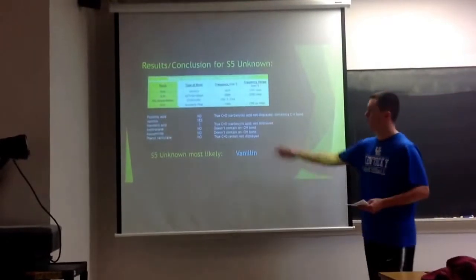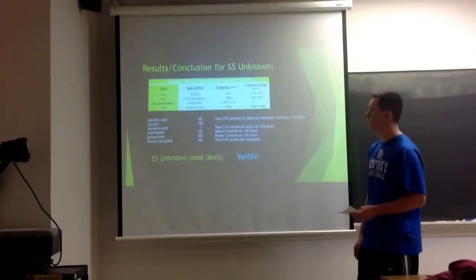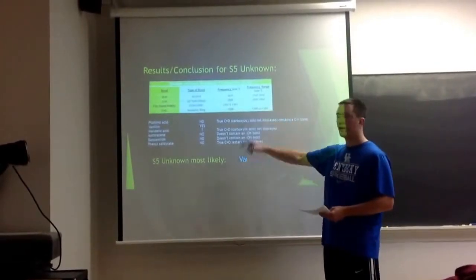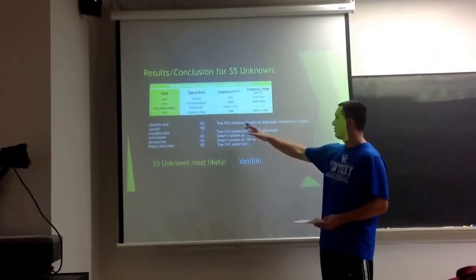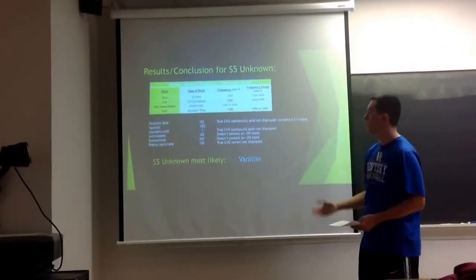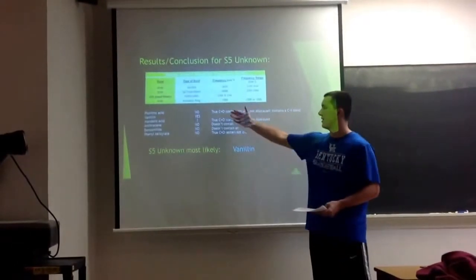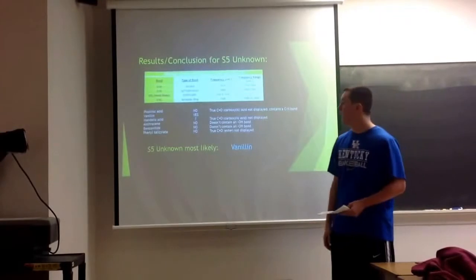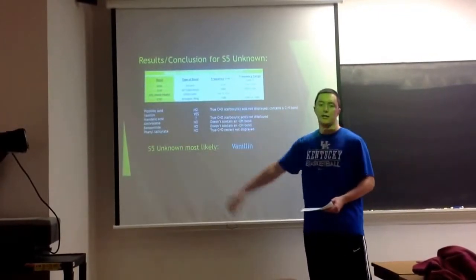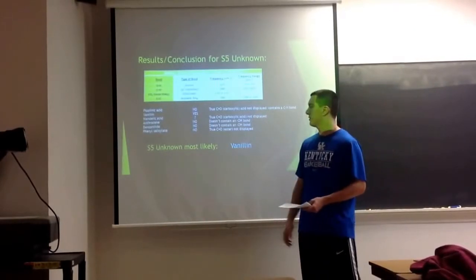For our results, of course, there's our chart with the alcohol, the sp3 CH, the disregarded CO2, and the possible aromatic ring. The first one I ruled out because there's really no true carbonyl, carboxylic acid group displayed. And also, this contains an NH bond, and that's just not present in this spectrum. The vanillin is actually what we thought it was, but we narrowed it down to vanillin and mandelic acid.